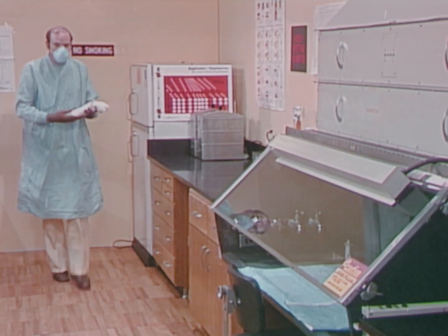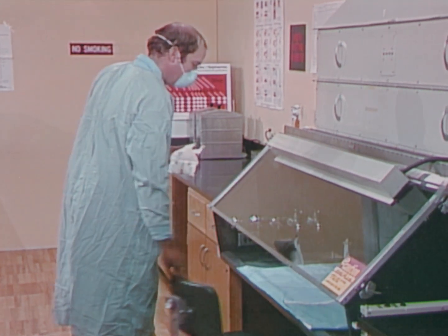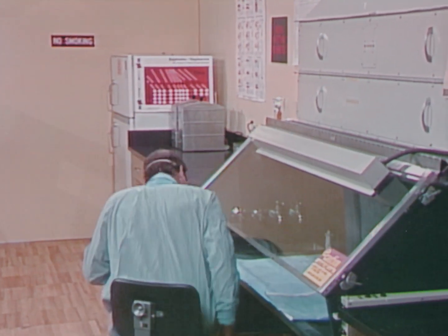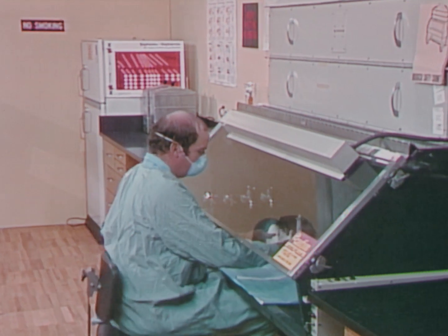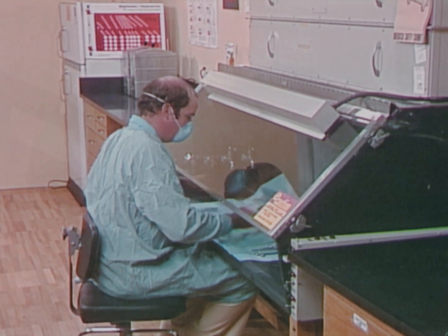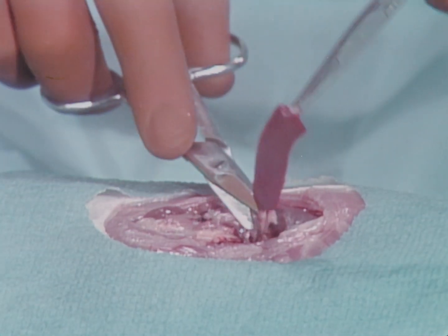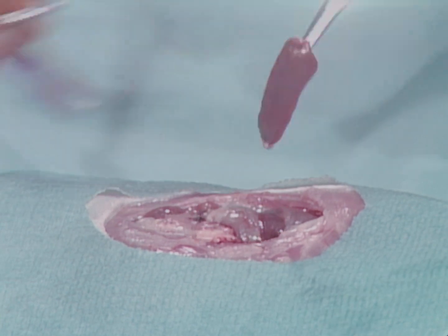Animal studies play a major role in some areas of microbiology, such as mycology and virology. Often in these studies, animals must be necropsied and the microbial populations in organs quantified. These procedures may result in the production of infectious aerosols.